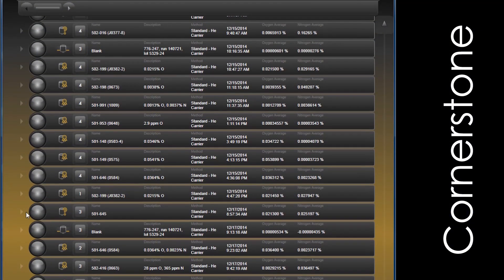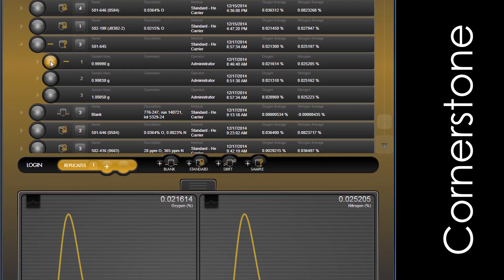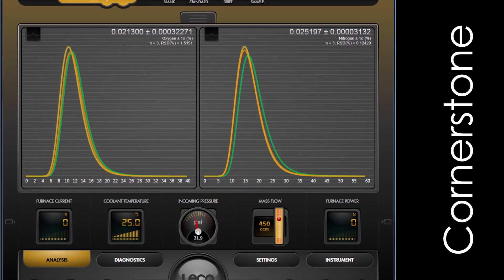designed specifically for easy touchscreen operation to streamline your analysis. Cornerstone software provides the user with complete access to analysis control, method settings, diagnostics, and reporting, without sacrificing valuable bench space.